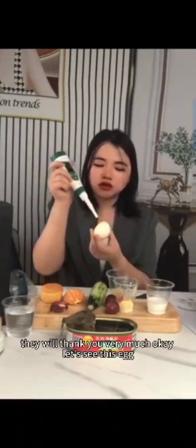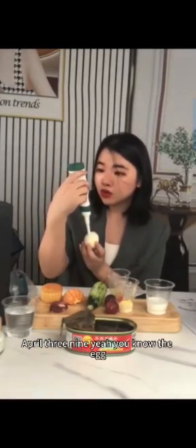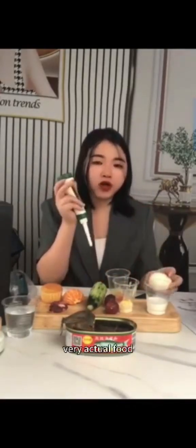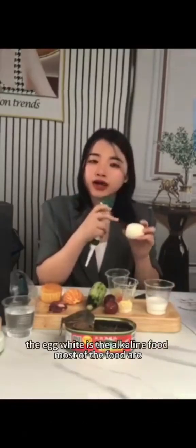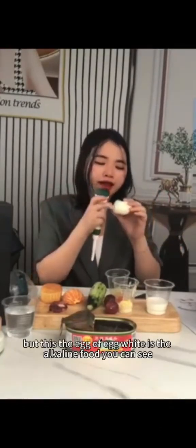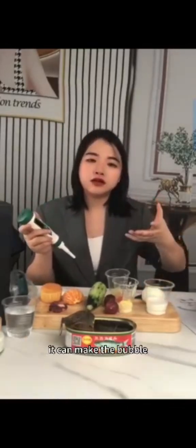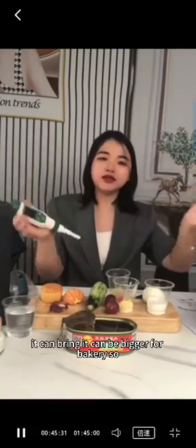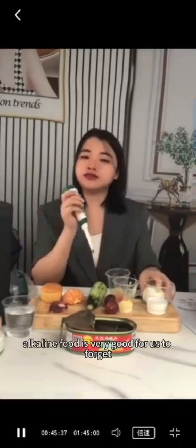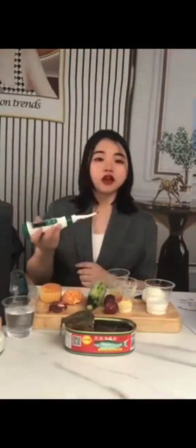Let's test this egg — the egg white is 8.39. The egg white is an alkaline food. Most foods are acidic, but egg white is alkaline. It can create bubbles and expand when baking, so it's very useful for bakery. Alkaline food is very good for us too.